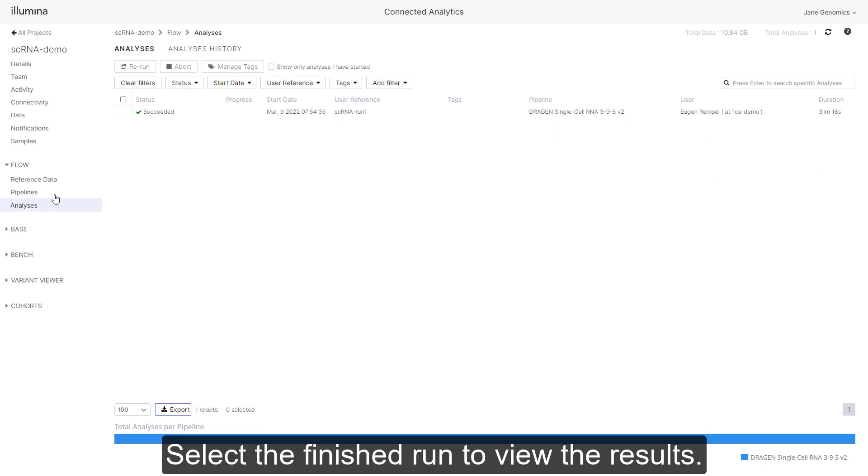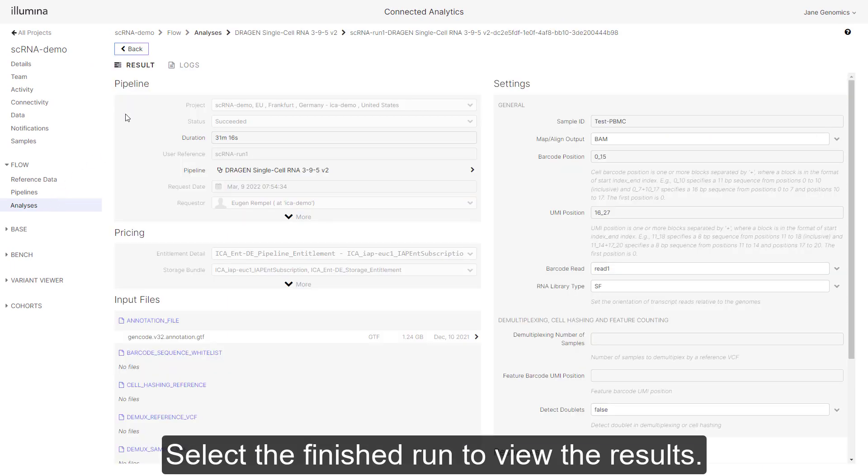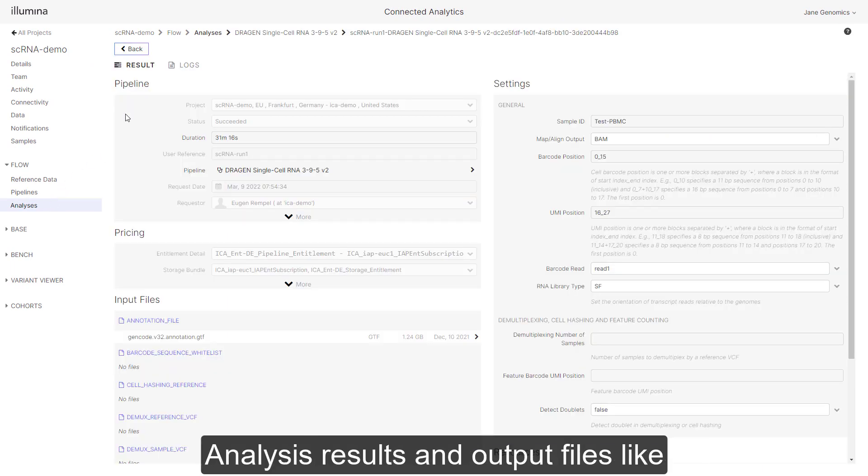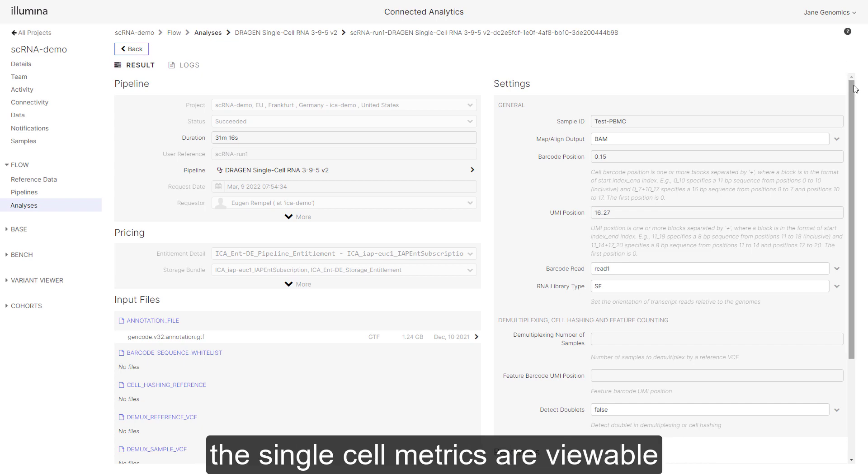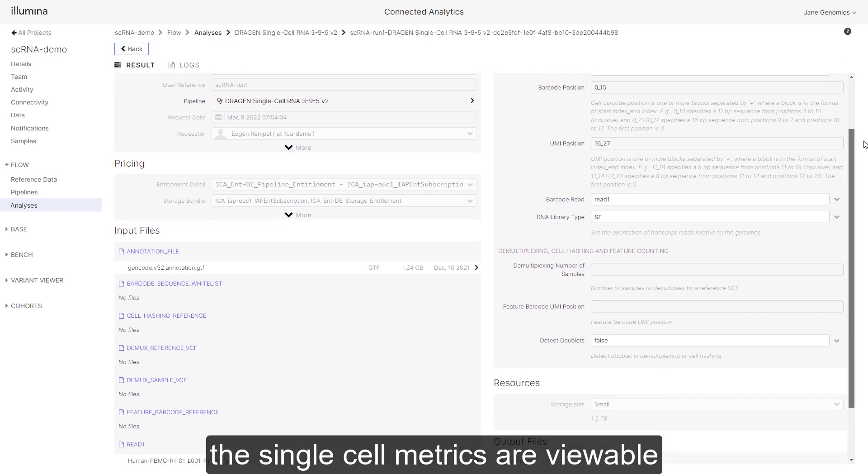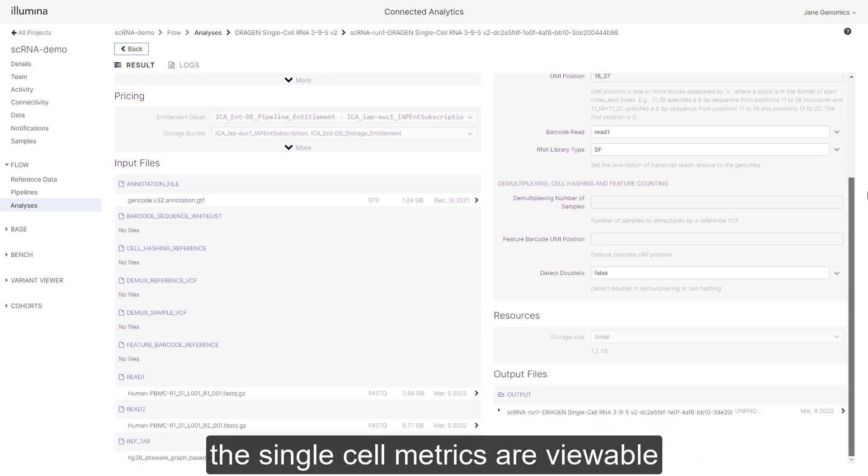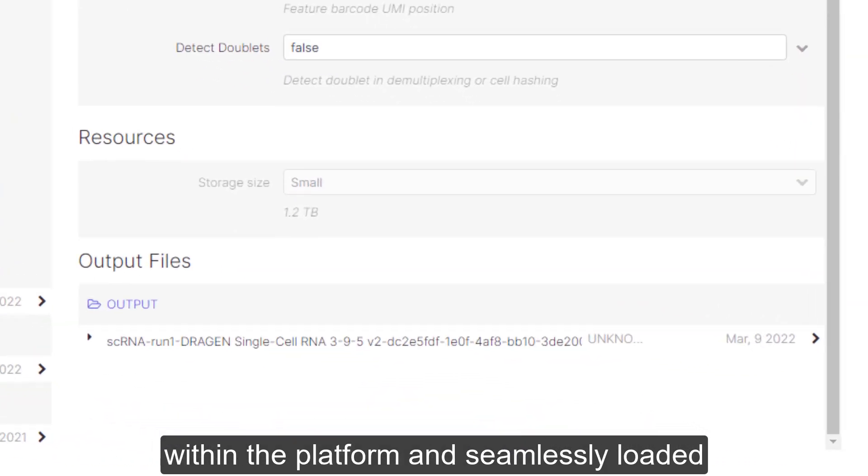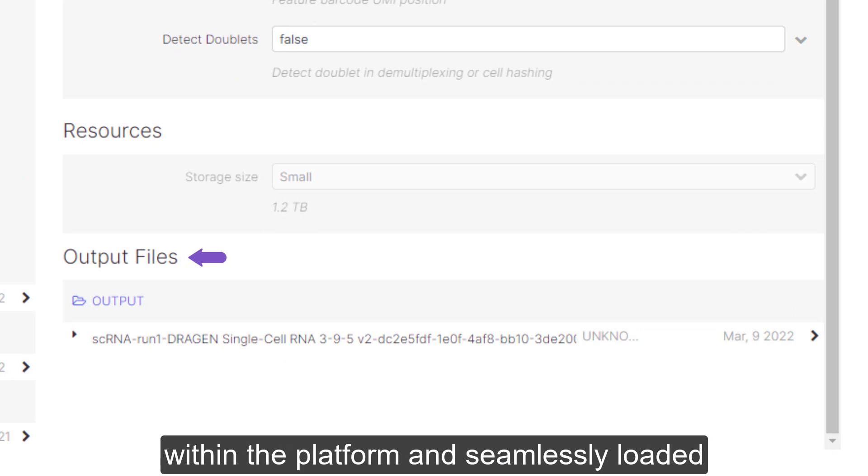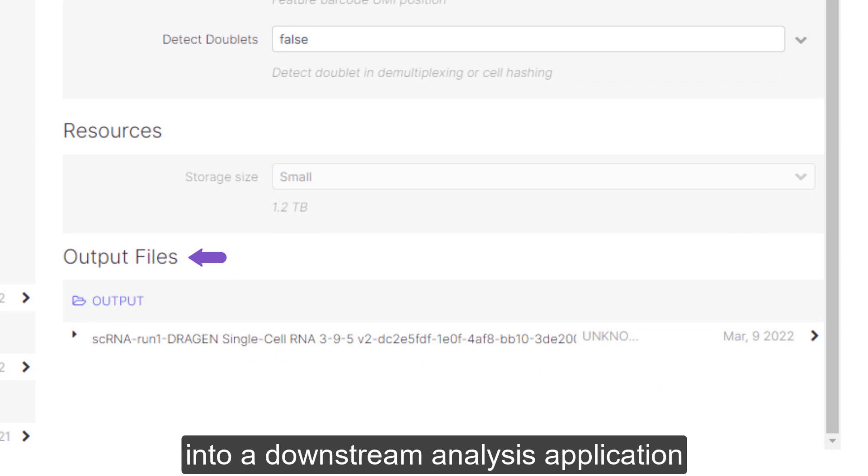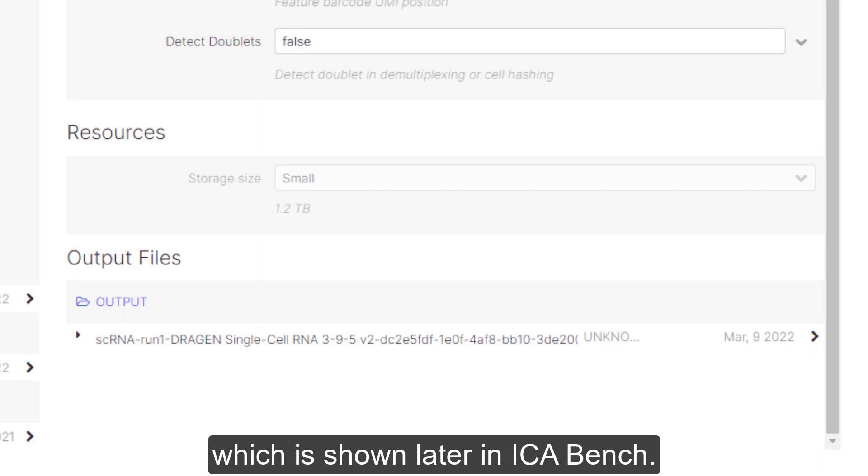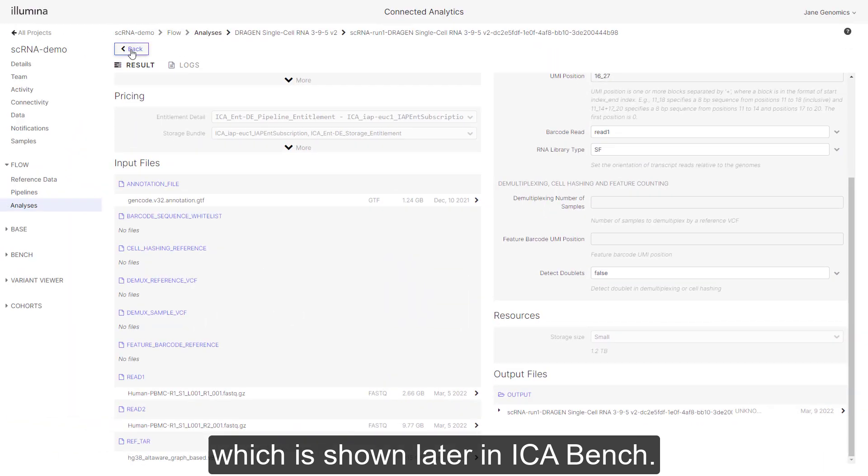Select the finished run to view the results. Analysis results and output files, like the single cell metrics, are viewable within the platform and seamlessly loaded into a downstream analysis application, which is shown later in ICA Bench.